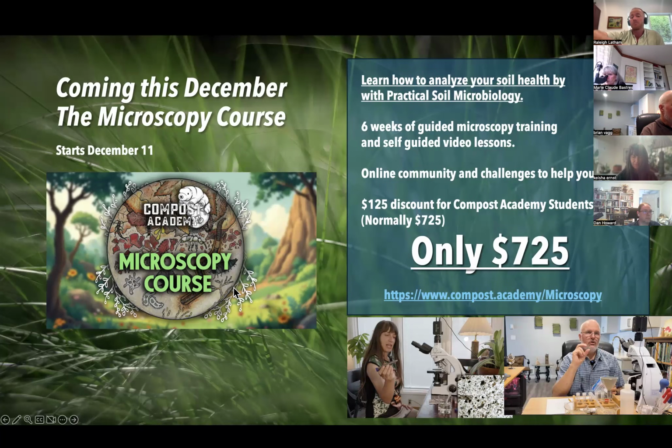I think one important distinction about this is that a lot of times we get bogged down in things like SMAP with quantitative analysis, and this program is really showing you how to do more fast and effective in-field qualitative analysis. So that when you're looking at samples, you can tell if you're on the right track and not get bogged down in analysis that takes hours and hours and hours to do per sample.